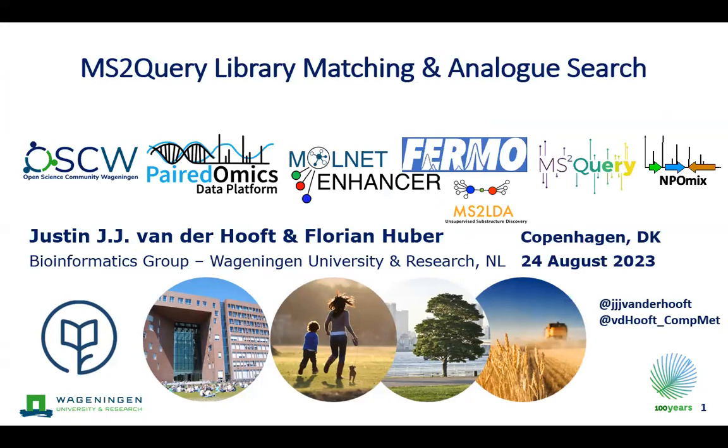Yes, so we will see what other tool we have that's going in this direction. And I will briefly show you at least one example of how you could add more information to these dots, so that if you have a name, for example, that's the idea. With the information we have now, we don't have a name. We have unknown spectra. The only information we have is things like the mass. But of course, if we use MS2Query, which we're going to see here, or Sirius or other tools that add a bit of extra information, we could load it into this plot as well, so that we can have a name or a compound class or a SMILES on these dots. It will be in a solution notebook, but I will show one example of it.